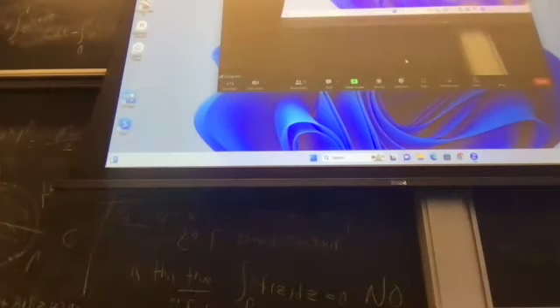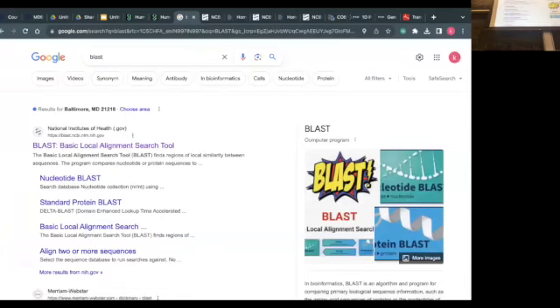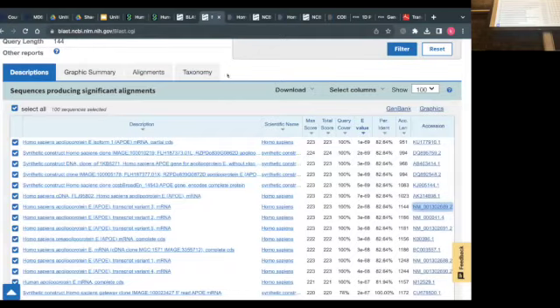Thank you for sharing. The other group, can you share your screen and then let's discuss it together? So we just got the FASTA sequence, so I just ran BLAST.